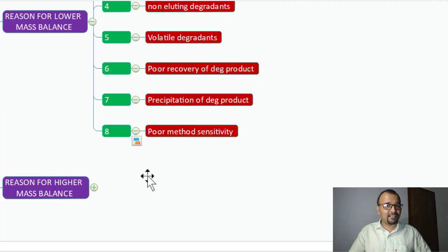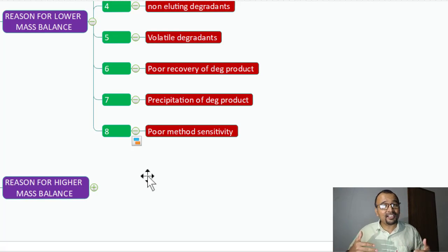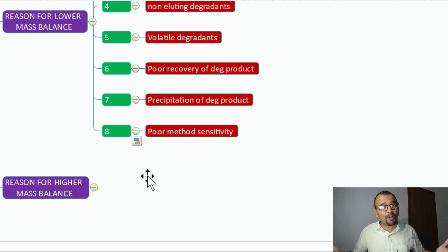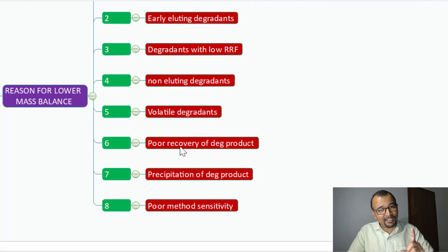Poor method sensitivity. If your method is not sensitive enough to detect all the small degradants generated during the forced degradation study, those small peaks which are not getting detected will be lost. You should understand your situation and identify which of these reasons is the most relevant scenario for your case.